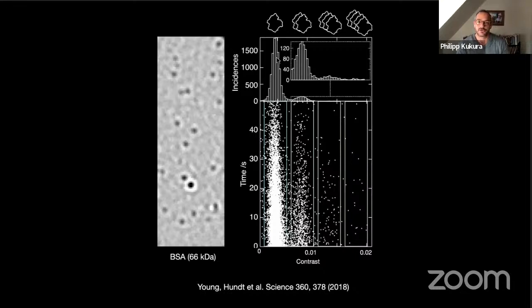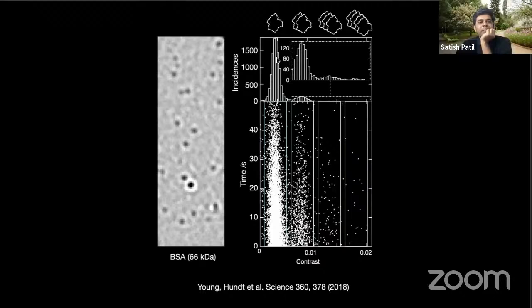I mean, that's where I'm in trouble, right? I don't really have high resolution. So if I had a mixture of proteins, 98% at 100 kilodalton, and 2% at 98 kilodalton, I wouldn't even know. Right. I have no idea. I wonder whether you would know with mass spec. No. And you might struggle, but yes.